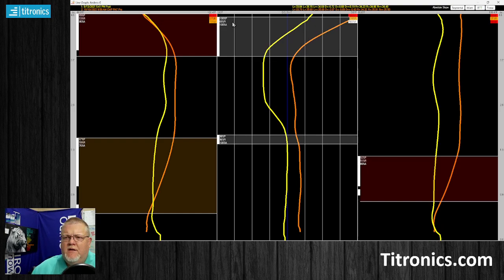And then the Pearson coefficient is, if we did the area under the slope, which is a calculus thing, what is the correlation between this graph and that graph? And it tells us 100%. So these are very likely the same, and these are probably going to be considered in pattern for just this area. On the left side, we had a 99, a 53, and an 86 up in this area. The right side doesn't play into pattern here. And then down here we had almost 100 on all 3. Here we had an 87, a 59, and a 76.